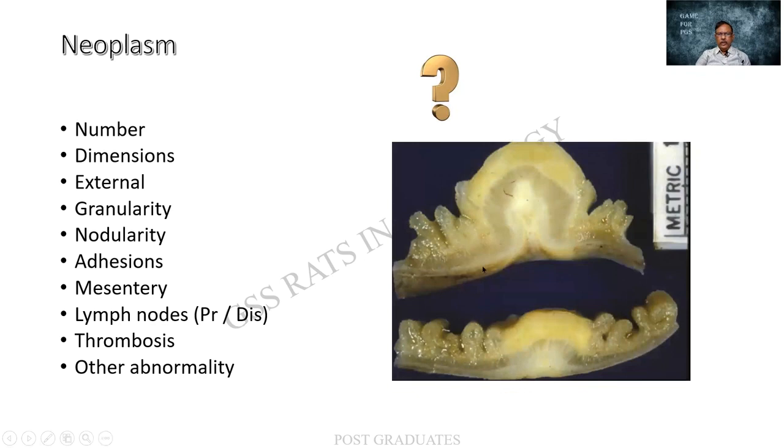Look at this one. Earlier I had told you something about a polyp, and in this case I am finding a lesion that is coming from beneath the mucosa. It is probably from the submucosa or even lower down, yellowish in color and more smooth outside. So it is not a cauliflower-like growth that we usually see in a malignancy. The yellowish tinge might denote that it is a carcinoid tumor.